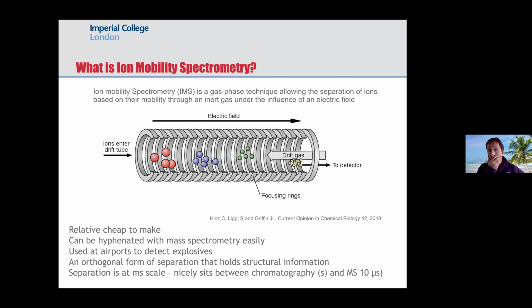I should have said that actually this type of design in terms of ion mobility has been around since the 1950s. So it was Earl McDaniel working at Georgia Tech that came up with some of the original ideas around ion mobility. So it has been around for 60, 70 years, but I think it's sort of enjoyed a bit of a renaissance recently as we've got better designs coming onto the market.